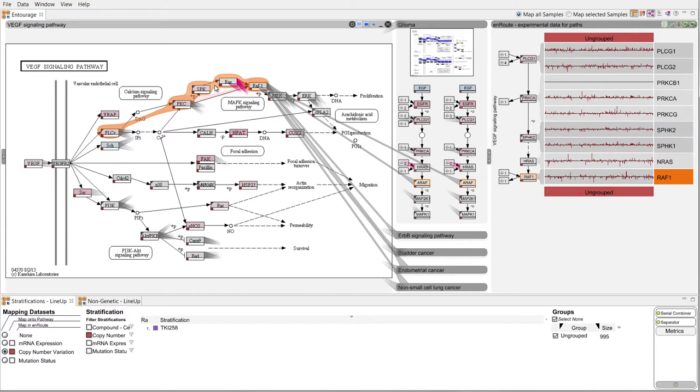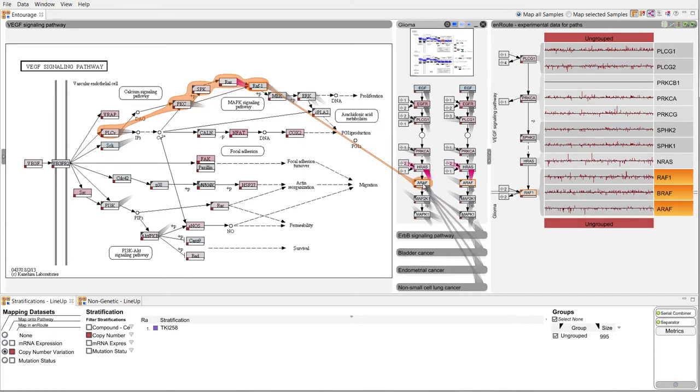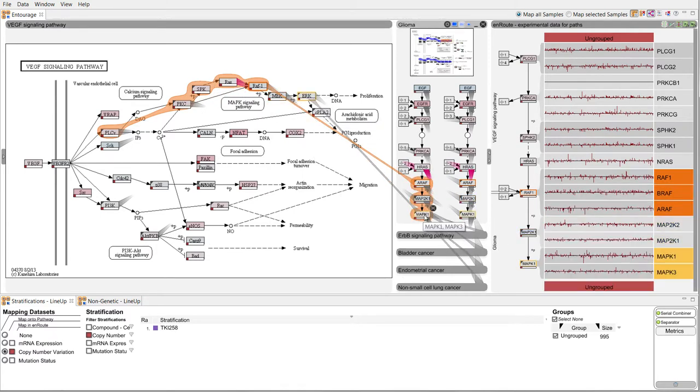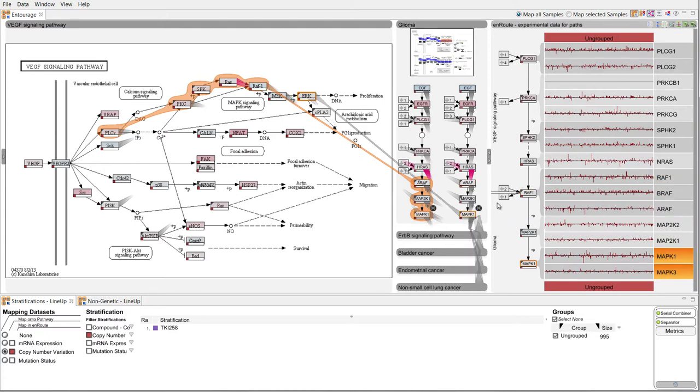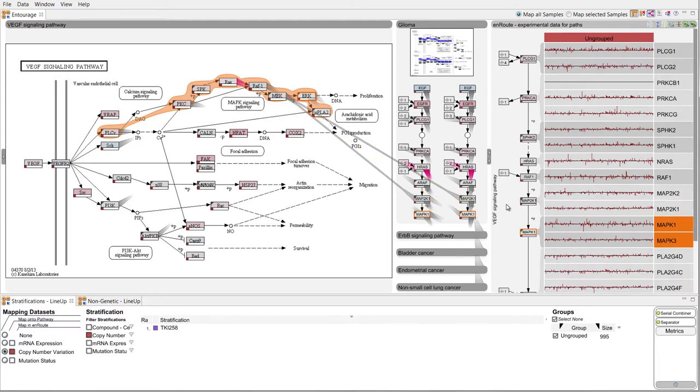Path selection is possible across pathways. We can switch between branches in the experimental data view. To show the experimental data associated with the selected path in more detail we can enlarge the view.